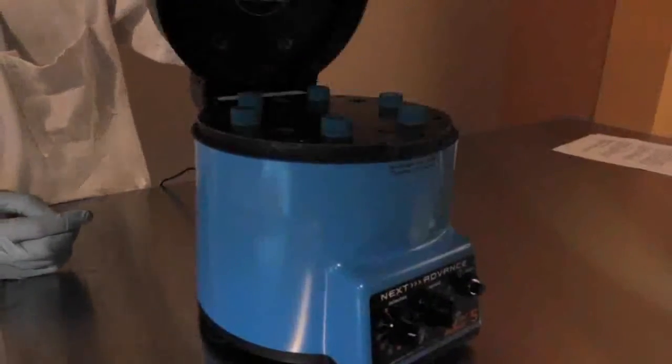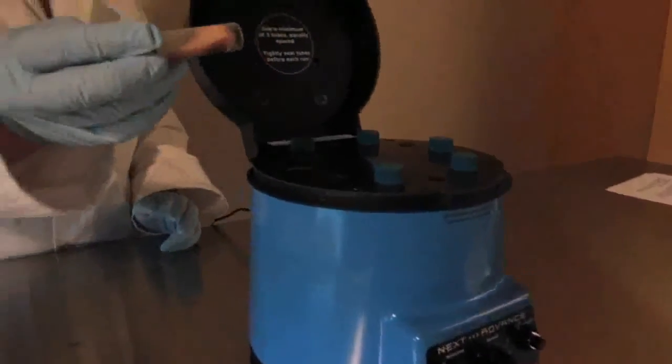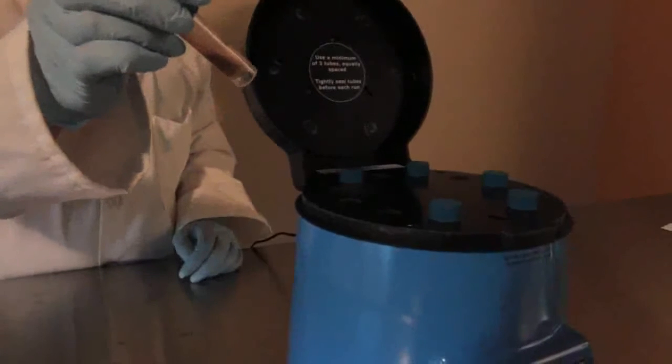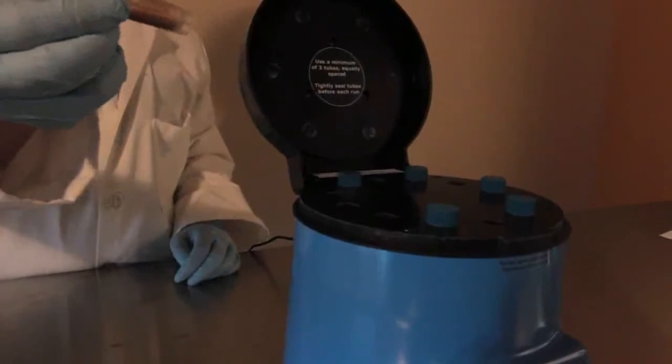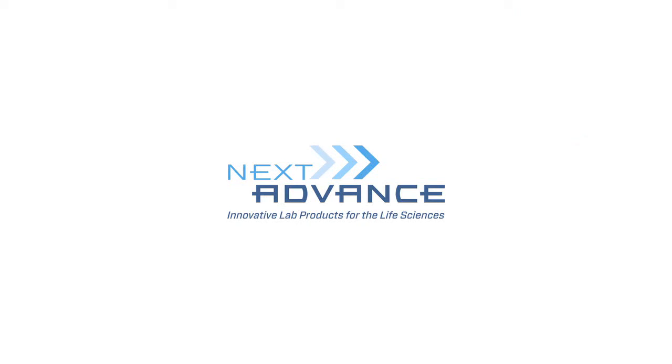Examine your samples. If you see unhomogenized pieces, place them back in the Bullet Blender and homogenize for another minute or two at speed 10. Now it's time to proceed with your downstream application.